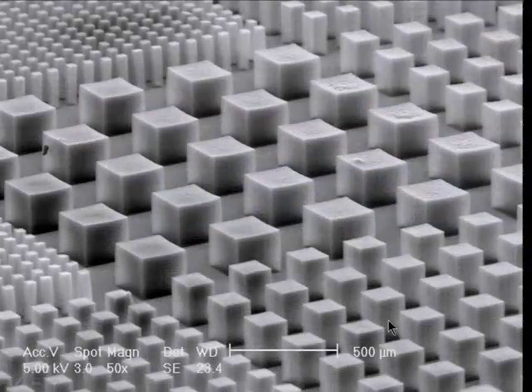So here's an SEM picture of an array of patterned vertically aligned carbon nanotubes. We'll see how these grow later, but here we've used optical lithography to pattern a catalyst, which we then put in a hydrocarbon atmosphere, and the nanotubes grow up, kind of like little buildings. One of the important things to note about scanning electron microscopy is how the interaction between the electron beam and the sample creates a kind of lighting effect. It looks to me, in some ways, like there are spotlights over here, but it's totally dark in there, and light wouldn't make a difference. It's the way the electrons interact with the sample that causes these kinds of shadows.